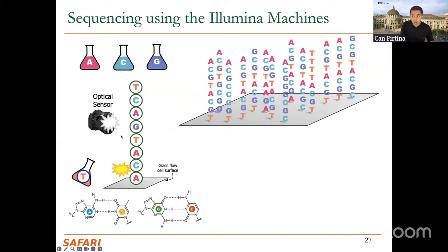But it may so happen that due to wrong washing, for example, we won't be able to wash all the necessary chemicals, or maybe we will wash too harshly, so that the synchronization between the duplicate information will be disrupted. So maybe when you reach 200, some of the copies will reach 220, some copies will reach 180, but most of them will still be around 200. Then this means that you can still take a consensus and be confident that, okay, we are at the 200 cycle. Some information tells me different color information, some other information tells me different color information. But most of the time, again, we have a consensus.